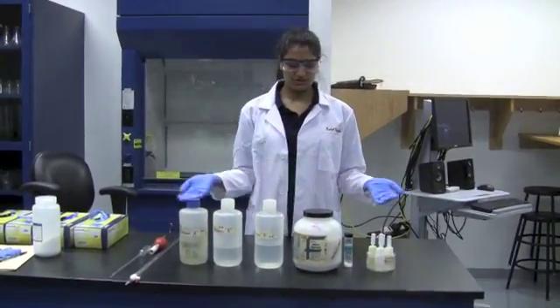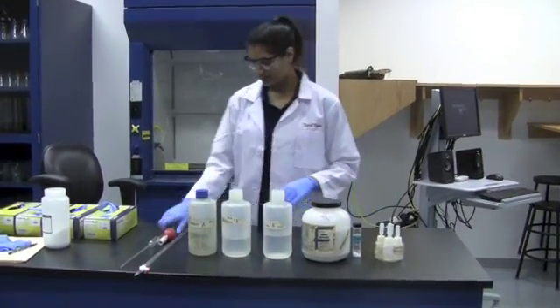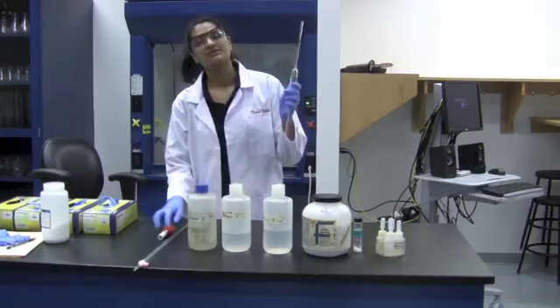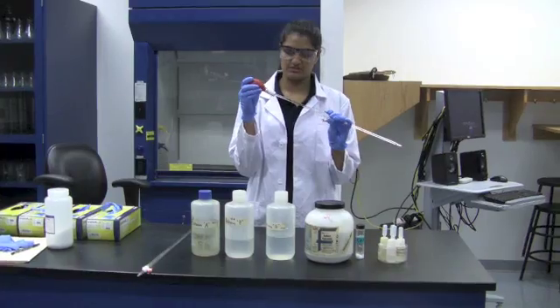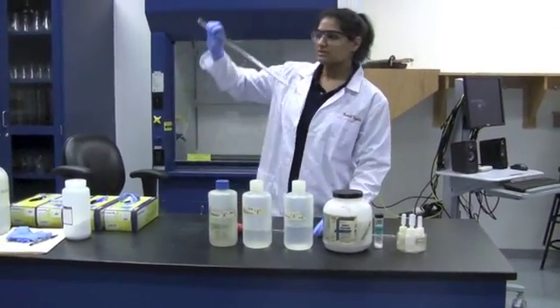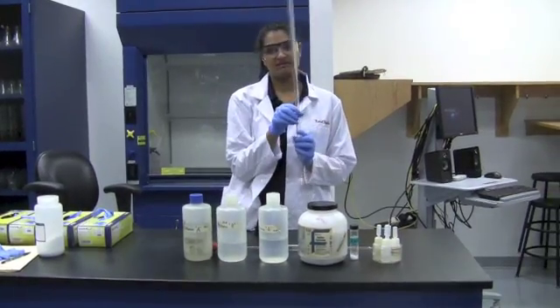These are the supplies you're going to be using in this week's experiment. You're going to be using a 25 milliliter pipette, as well as a bulb that you're going to use to draw out the solution. You're also going to be using a burette for the titration.